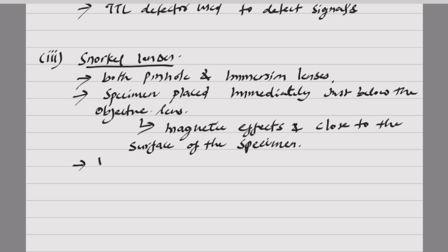It enables high resolution imaging while also allowing various dimensions of specimens. There is no restriction, unlike immersion lenses.